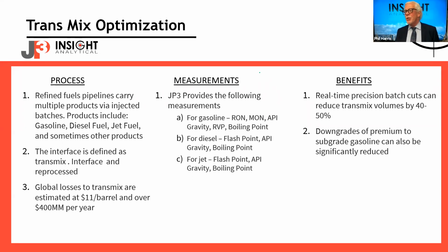So the question was, what are the types of online analysis that we compete with? We've replaced a lot of chromatographs on difficult liquids applications, dirty condensates. When we talk about condensate up here, this is a natural gas condensate from a debutanizer. And you can see it's nice and clear. One of my service team ran his lawnmower on this. This is the natural gas condensate we see in a pipeline, or off the bottom of a condensate stabilizer. And this one you can run through a GC relatively easily.